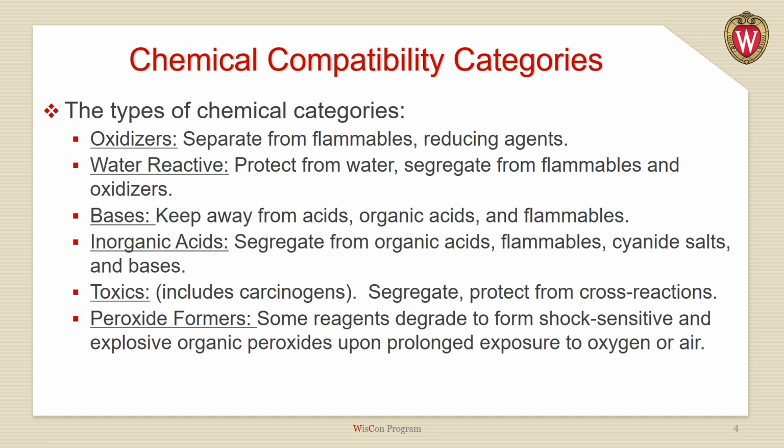Toxics, including carcinogens, segregate and protect from cross reactions. Peroxide formers: some reagents degrade to form shock-sensitive and explosive organic peroxides upon prolonged exposure to oxygen or air.